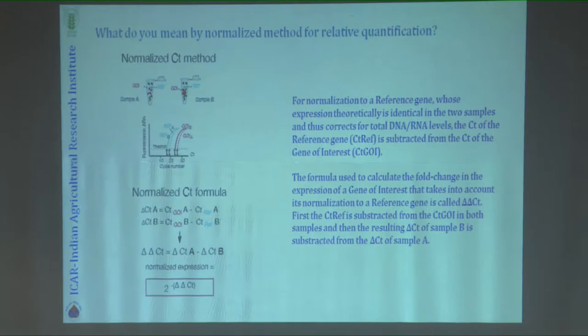I'm not getting into that, because once you get a machine and go into a real-time experiment, then you can use it depending on the kind of resolution you want with the number of data. I want to give you an example. If you want to know how many persons are within the campus of IRI, what will you do? What is the kind of resolution or precision you want to know? This number is going to vary, okay?